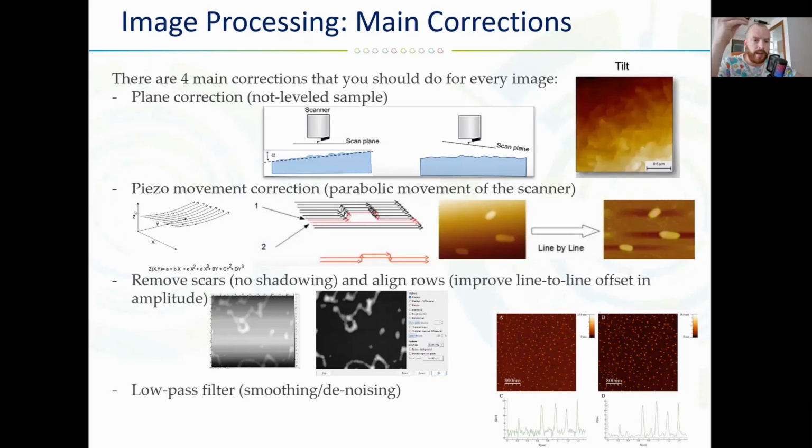So we do not have the plane all the time. We can retract like this and like this, but if we want to move here or there, we do it like this. So it's a semisphere or sector, and this we should correct first, usually. The first one is the sample.